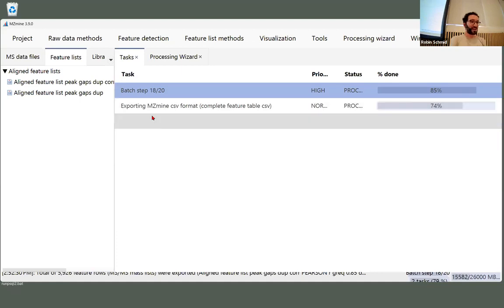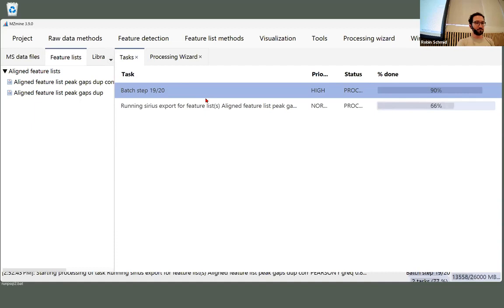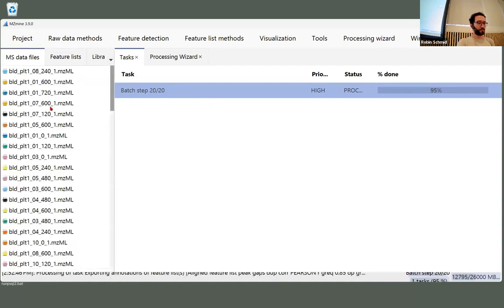Okay, so we're mostly done. We're exporting a bunch of things here.